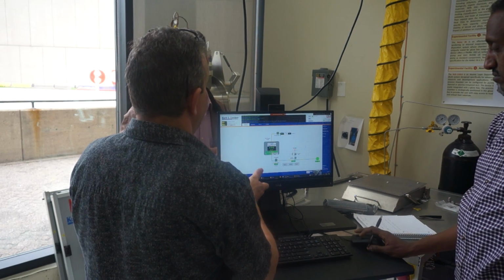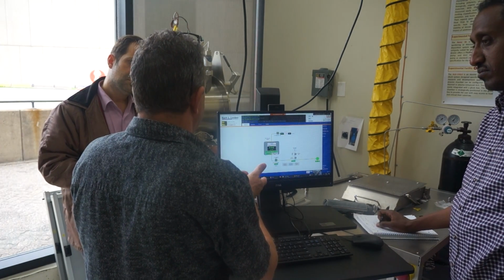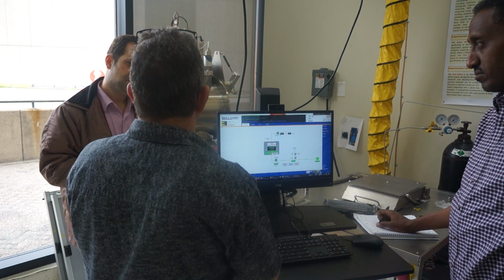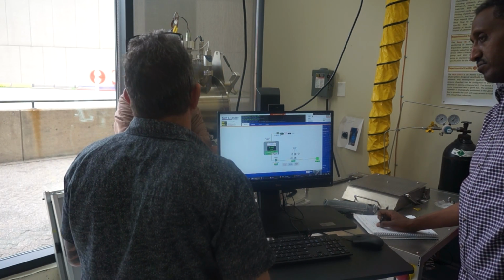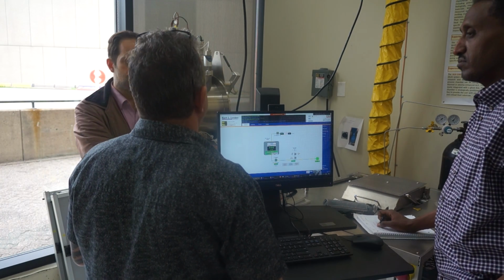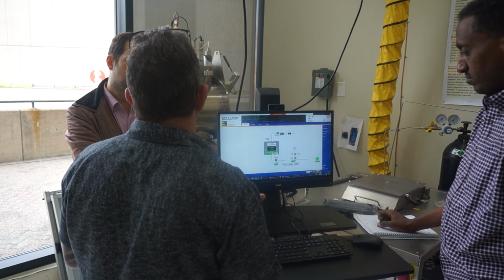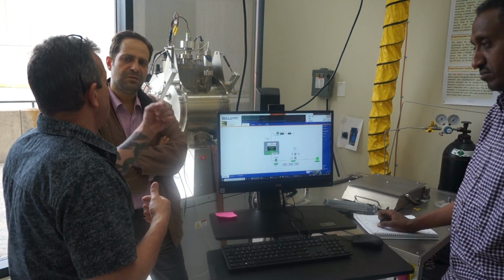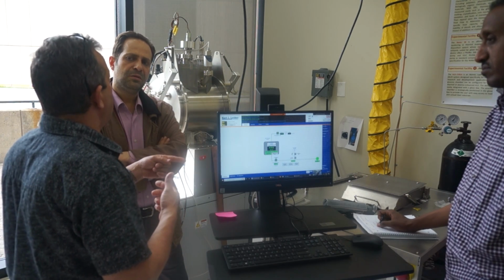If you're using TMA, it's a chemical process. Yes, but you can only get aluminum oxide from TMA. You can't get anything else. So if you want something different, you have to put a different chemistry in it. If for some reason your process will require titanium oxide, you would have to either put TDMAT on 3B or swap that ampoule out.